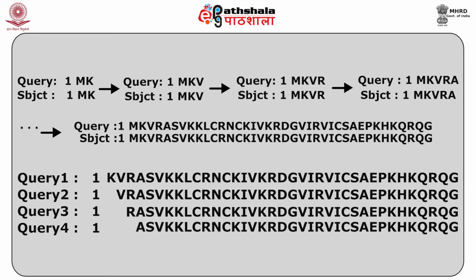In the example shown above, we looked only for sequences that exactly match the query. The algorithm would not even find a sequence that is identical to the query with the exception of the first letter. To find such sequences, the same analysis should be conducted with the fragment starting from the second letter of the original query and then from the third one, and so on.